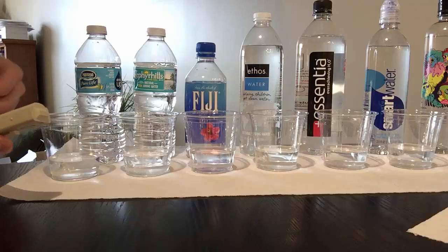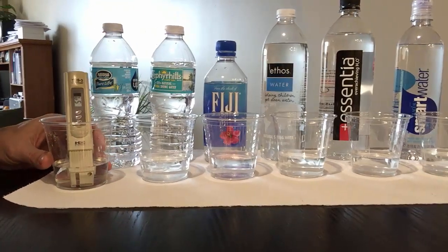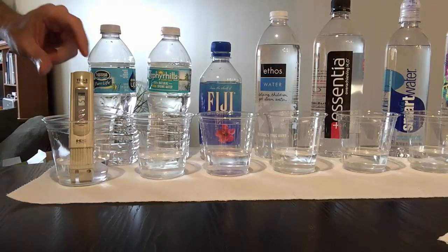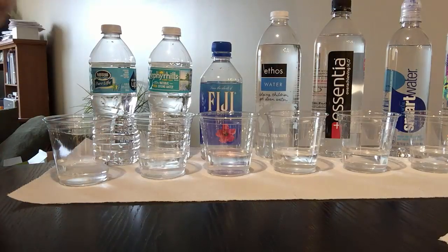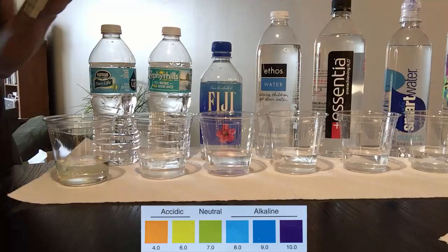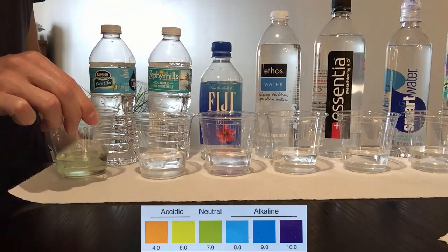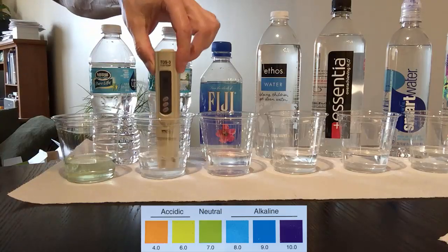So, Nestlé Pure Life. According to the bottle, the water came from underground here in Florida, and it shows a TDS of 57, which is not bad for underground filtered water — but if you live in a different state, your water will probably come from a local source. The pH test with a few drops of reagent turns the water somewhat green, so it's just about neutral.